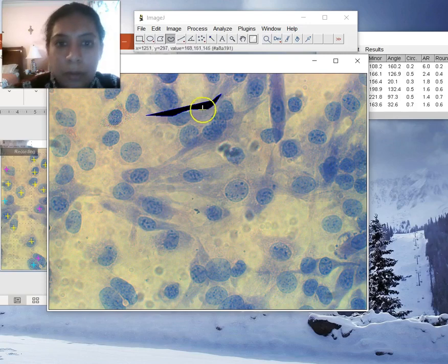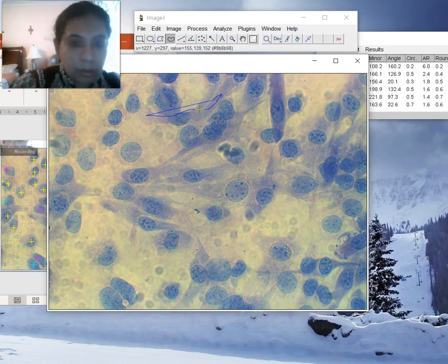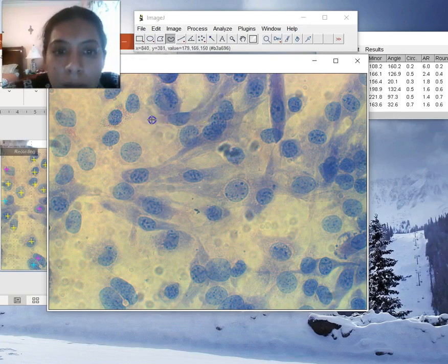That one, oh, sorry. That was not done very well. But that way, it keeps track of it, and you don't make a double count on the same cell.